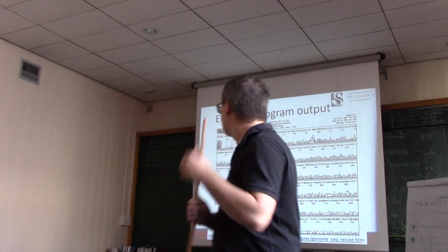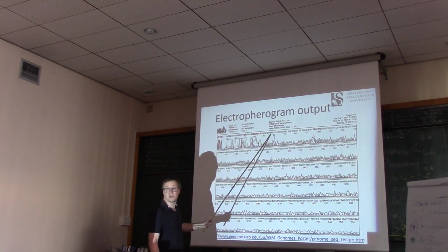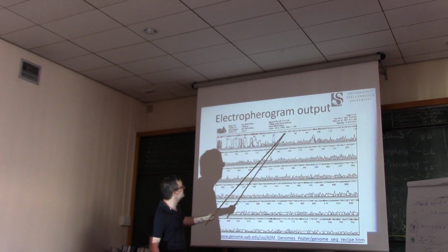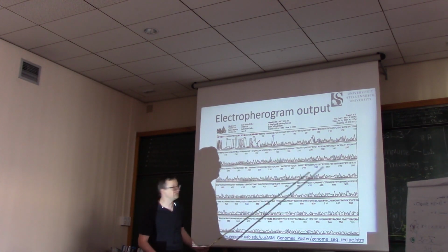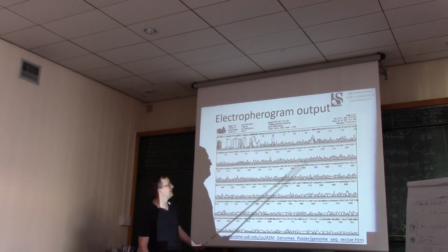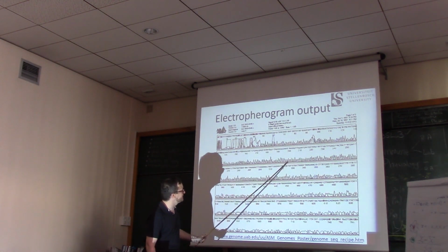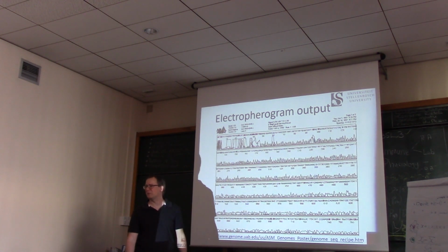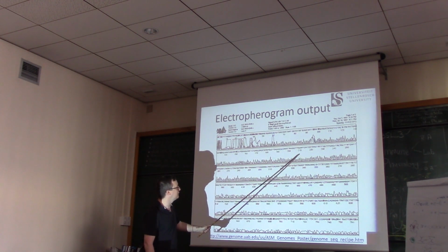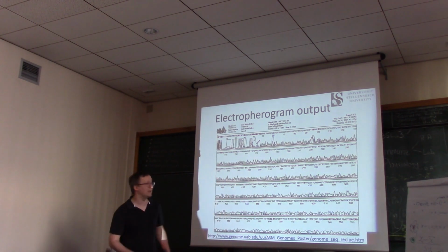So I'm going to point out that in this diagram, we have green peaks that correspond to A's, blue peaks that correspond to C's, red peaks that correspond to T's, and black peaks that correspond to G's. So if you see a green coming up and down all by itself, you say to yourself, that green corresponds to an A in the sequence at this position. Now, if you look at this area and this area and this area, you probably say, well, it's pretty clear, I could read that. Red, red, green, green, green, green, black, green, green, green, green, I'm sorry, red, red, red. You get the idea. Not that hard to just read these and interpret them directly.